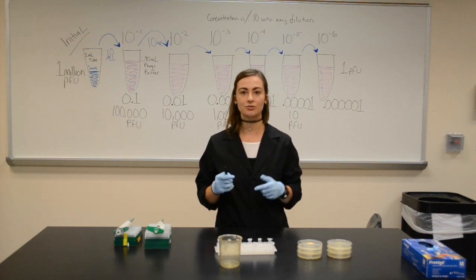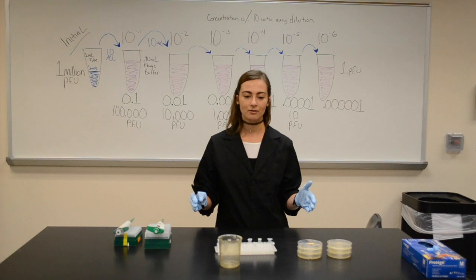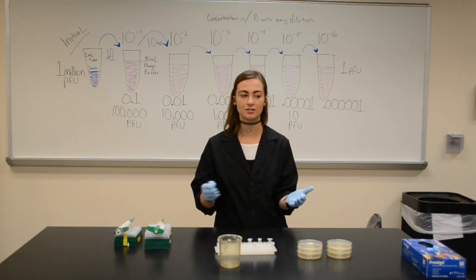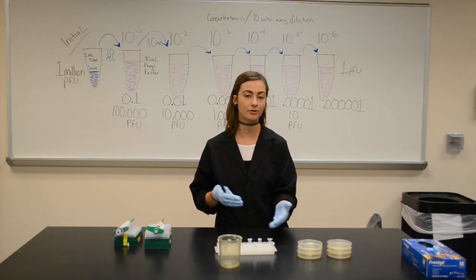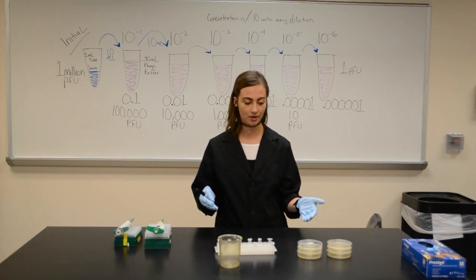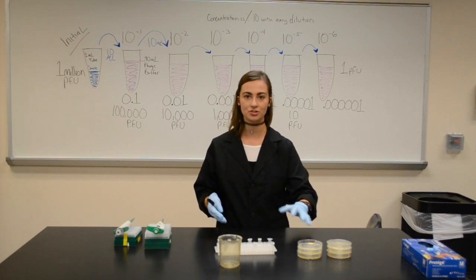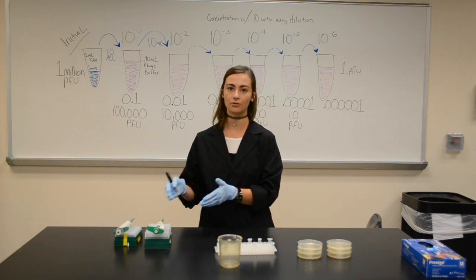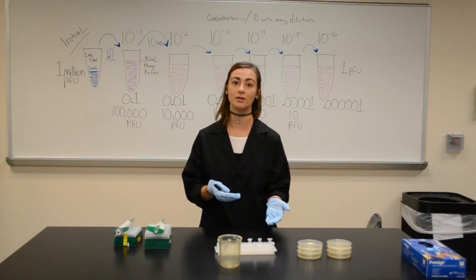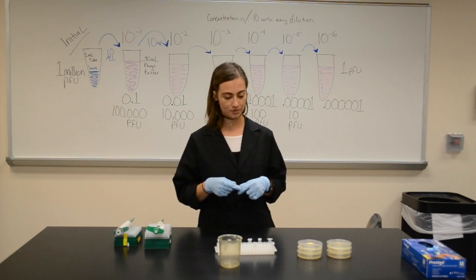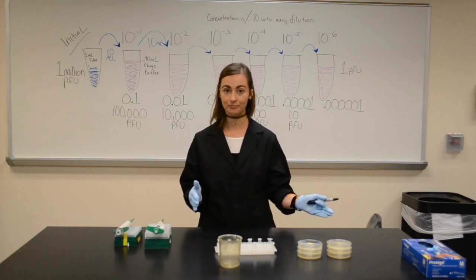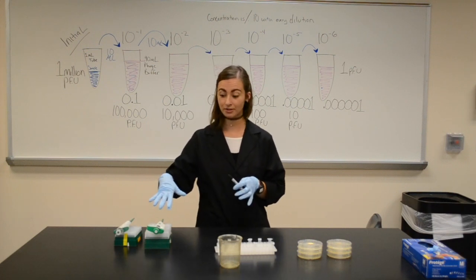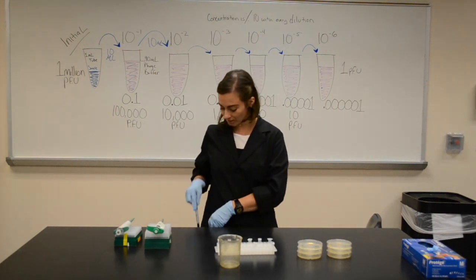It's really important to make sure you label everything first because, especially being at a table with other students or just having craziness going on, you ask a question, someone starts talking to you, you forget what you're doing, where you are. Having six plates just in general on your table can be confusing. So just making sure all your ducks are in a row before you actually get going will save you a lot of time in the end. I have everything labeled, I have everything out, I have everything clean, and I have my micropipettes cleaned off.